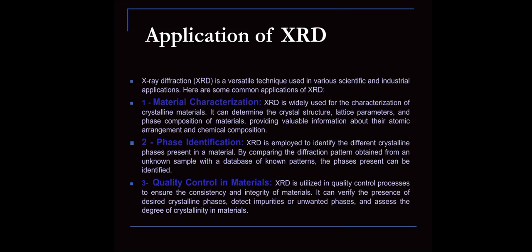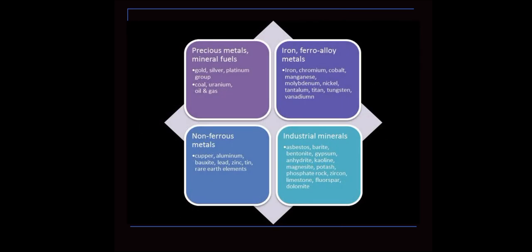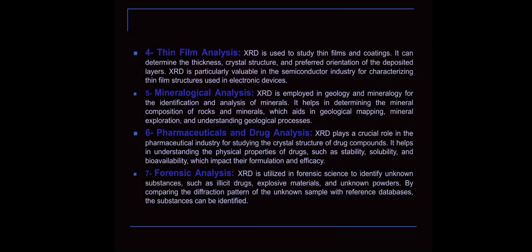The third one, quality control in materials. XRD is utilized in quality control processes to ensure the consistency and integrity of materials. It can verify the process. This is the main application of XRD. Fourth one, thin film analysis.